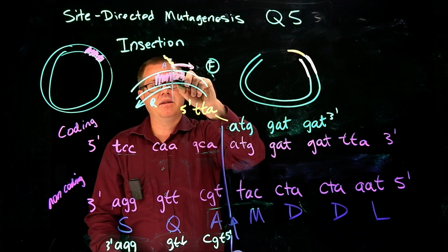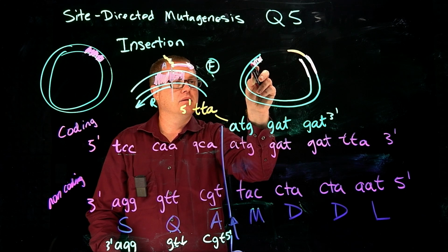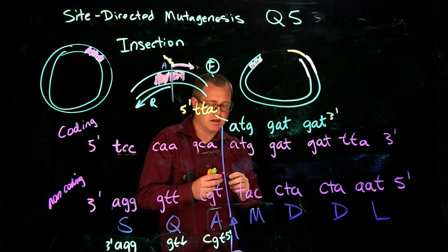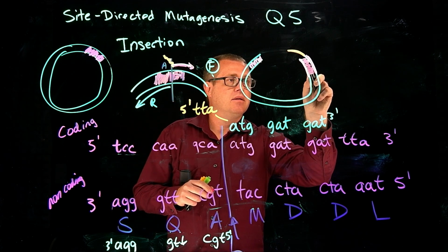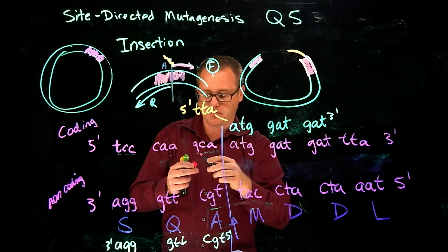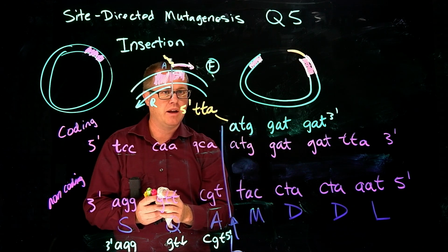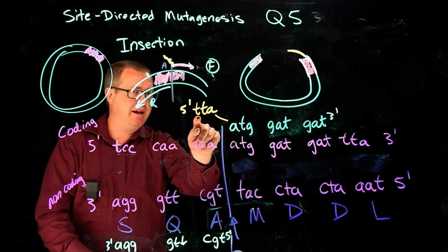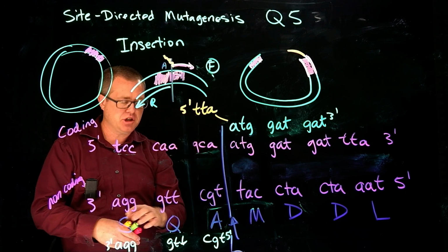And then we come to this part right here, which is right there. Okay. So there's our gene of interest, right there. Now, I don't know if this is coloring very well for you guys, but this right here, the TTA, and this little squiggle right there, that's in orange.